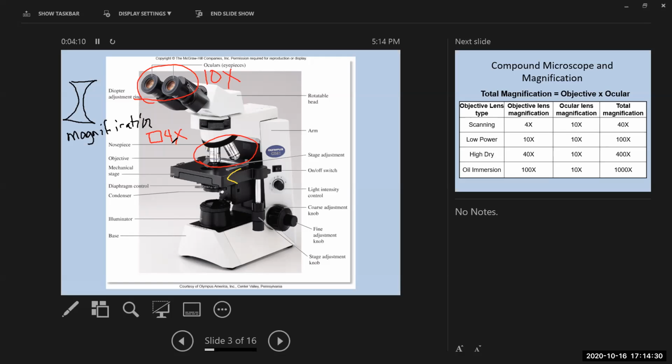Whenever you're looking through a microscope or telescopes, they have these different magnifications. And if they're in tandem with one another, you just end up multiplying each individual magnification. All right, so when you use a microscope, it's always best to start off with the lowest one first, and then gradually get higher and higher in magnification. So if we look at the next slide, go to that.